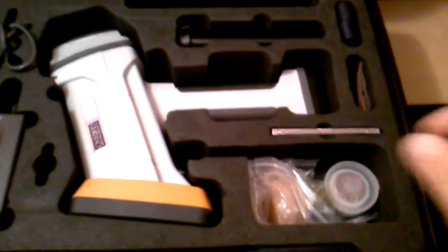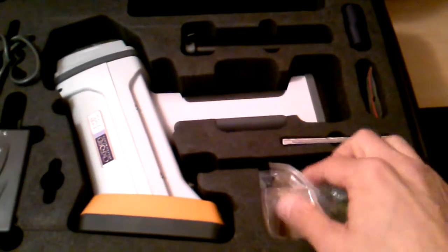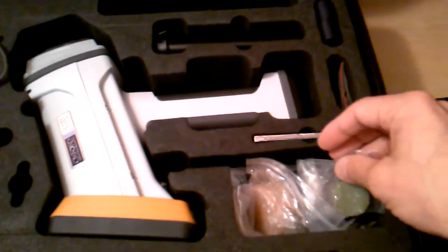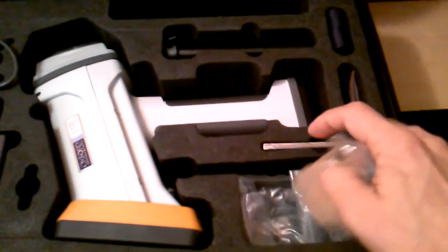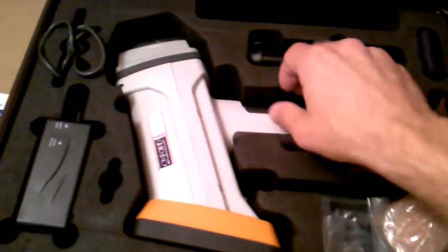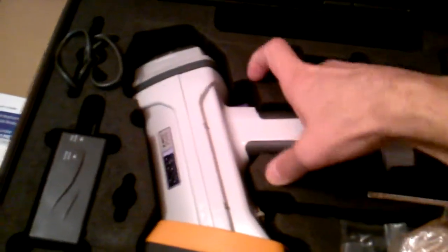For the demonstration model we have some sample materials in here. Soils, plastics for hazardous substance, SAC alloys, and then of course the unit itself.